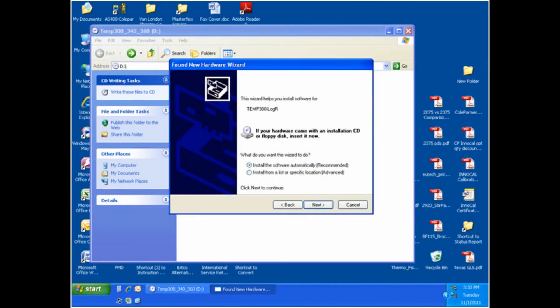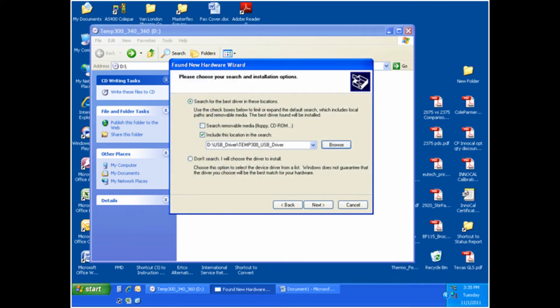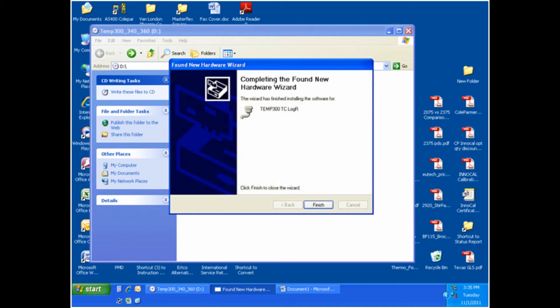The next thing that will need to be done is to install the USB driver onto your computer. Insert the USB driver's CD into your computer's CD-ROM drive and connect your TEMP 300 to the computer using the USB cable. Your computer should automatically detect the meter with a message saying that a new device has been found. Follow the prompts to install the software. We have shown the installation process in this video for you to view.